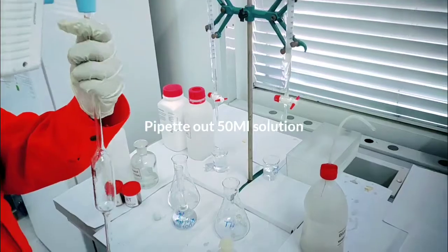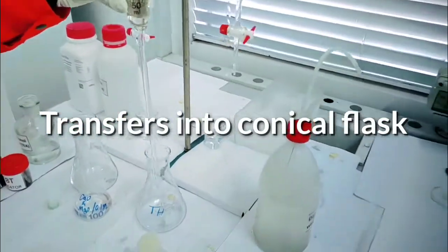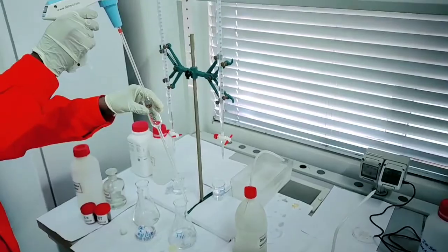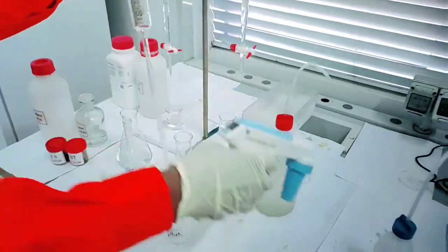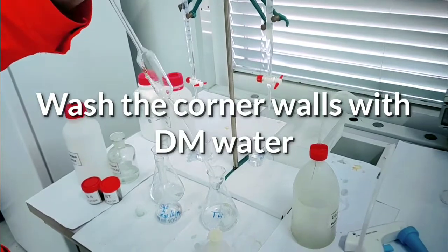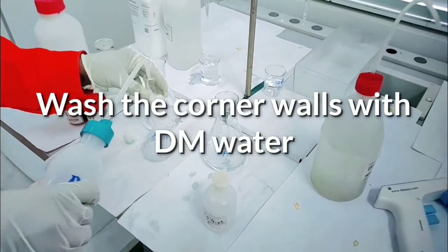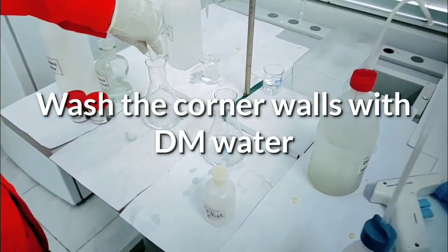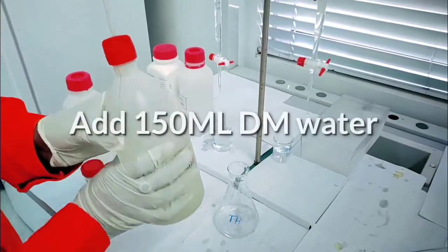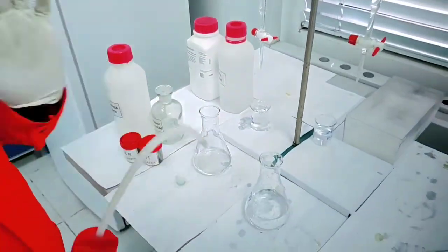Pipette out filtrate solution 50 ml. Transfer into a clean conical flask. Rinse the pipette and conical walls with distilled water. Add 150 ml distilled water to each conical flask.